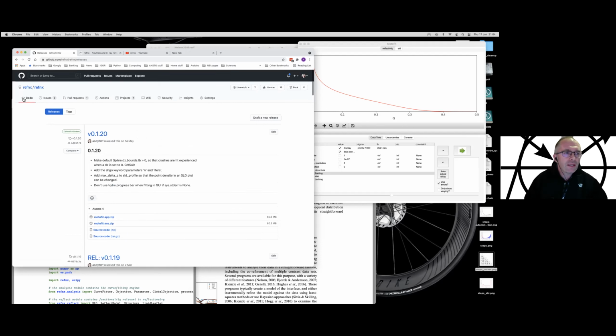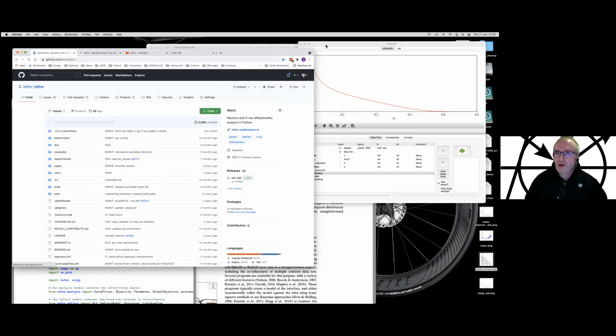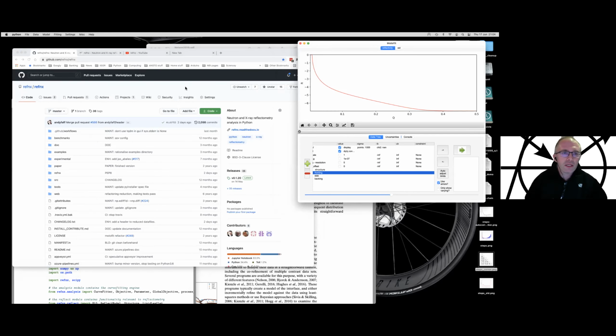It will also run the GUI on Linux, but I don't have anything to package that on, and I'm not even sure you can package into single executables on Linux.